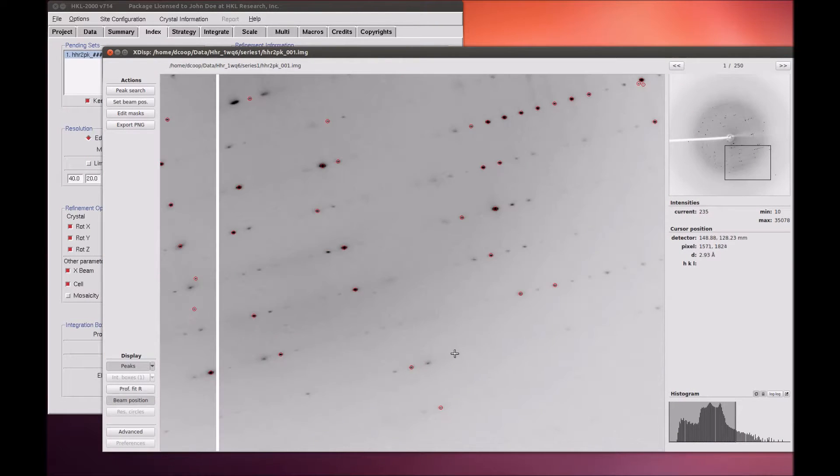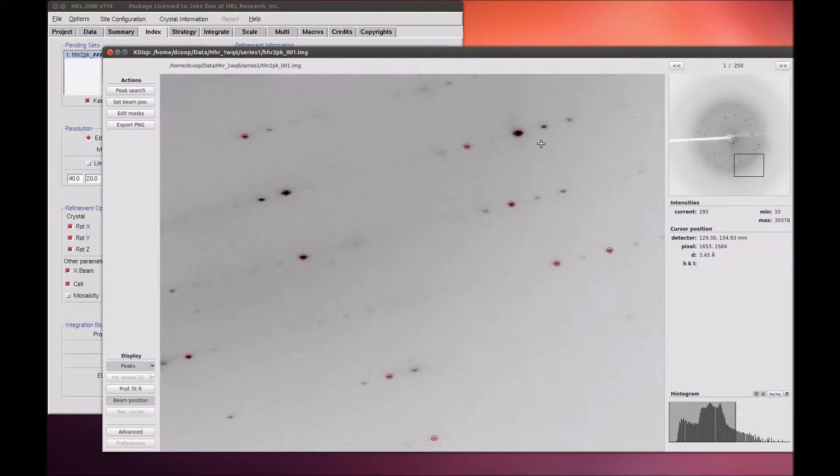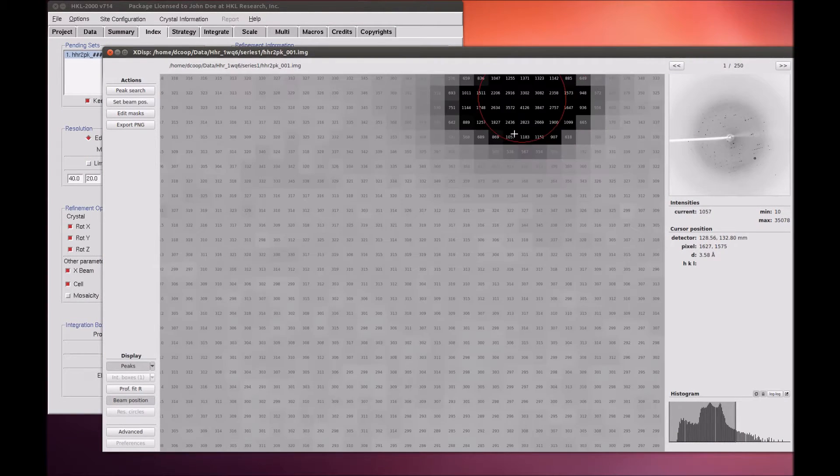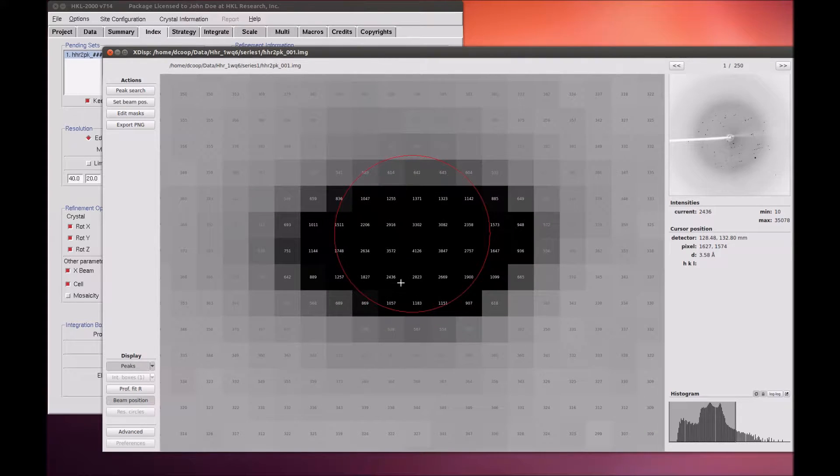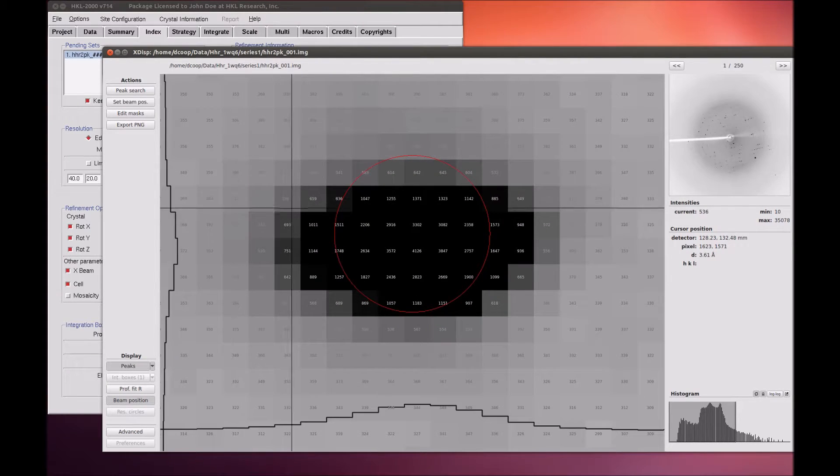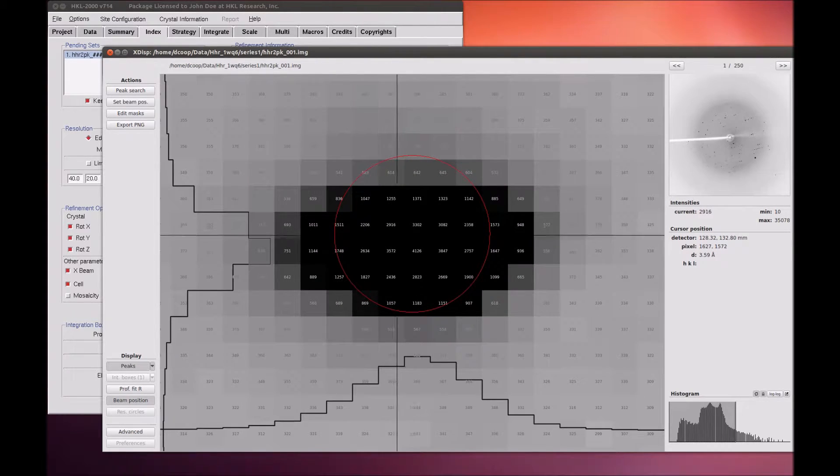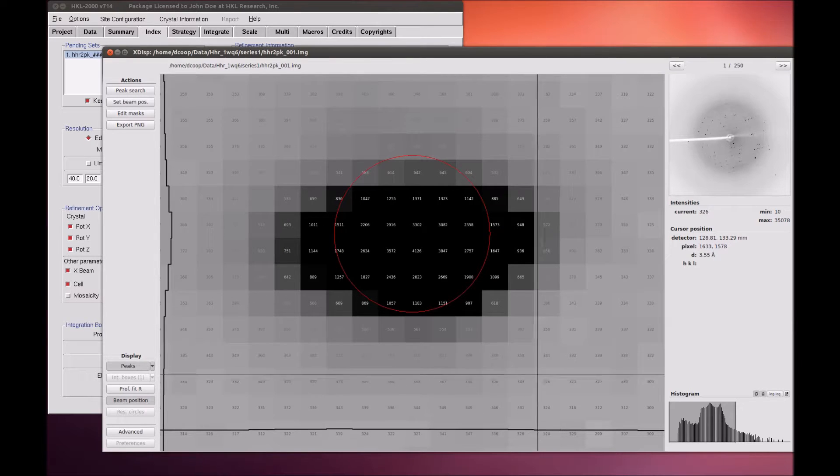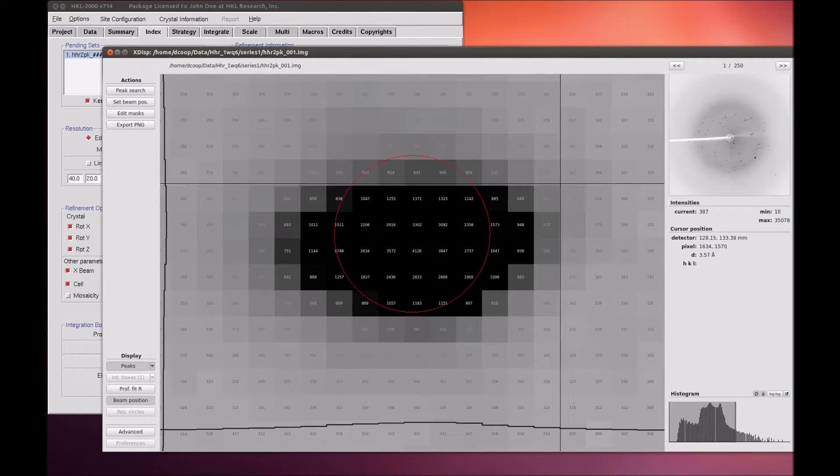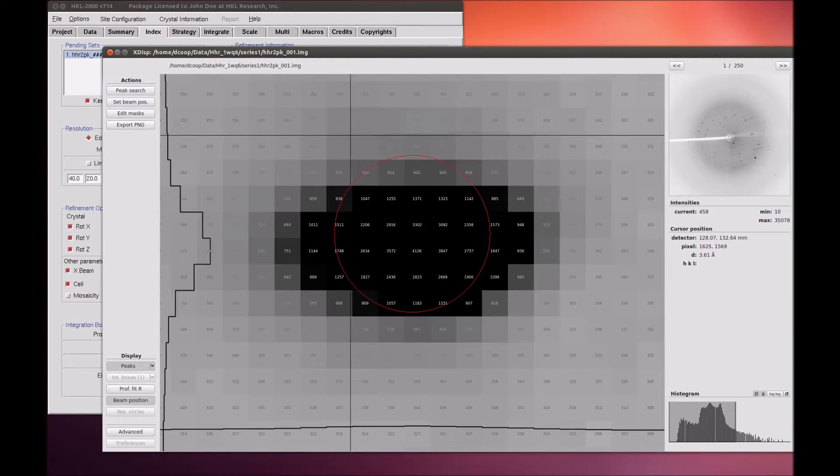Zoom in far enough, and the numeric intensity value for each pixel will be displayed. Click and drag with the right mouse button to show a crosshair and intensity distribution for the vertical and horizontal lines displayed on the respective axis.